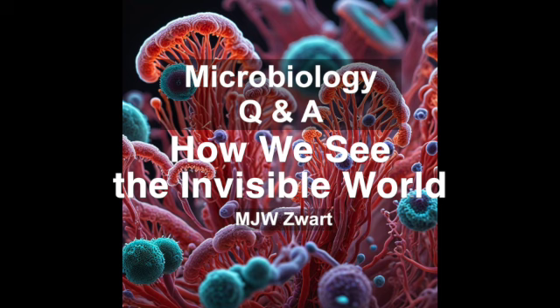Exactly. And because electrons have a much shorter wavelength than visible light, electron microscopes can achieve significantly higher resolution. So we can see even smaller things. Yes. Things even smaller than what's visible with the most powerful light microscopes. That's incredible. It's like opening a new window into the world of the ultra-small. Okay, so that's electron microscopy in a nutshell. But I'm guessing there are different types of electron microscopes too, right?